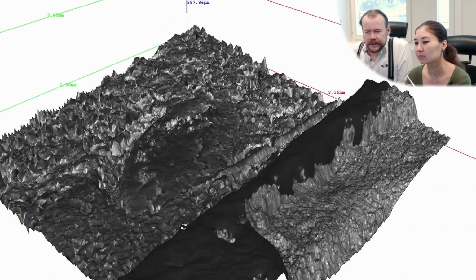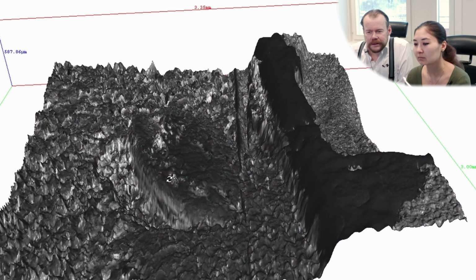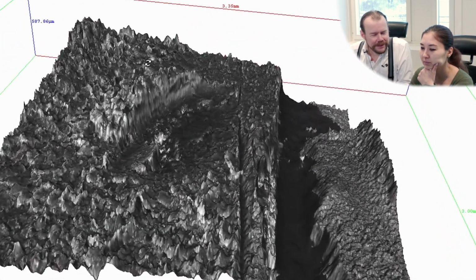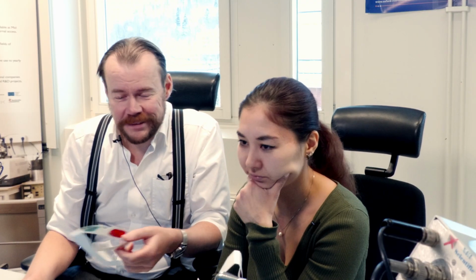Here we see our sample, and now you see that there is a hole here. But it is actually something pointing up. You see, it became upside down because you chose the positive angle on the left image. Then it becomes upside down. But it's the same data set. You just flip it like this and everything is fine.